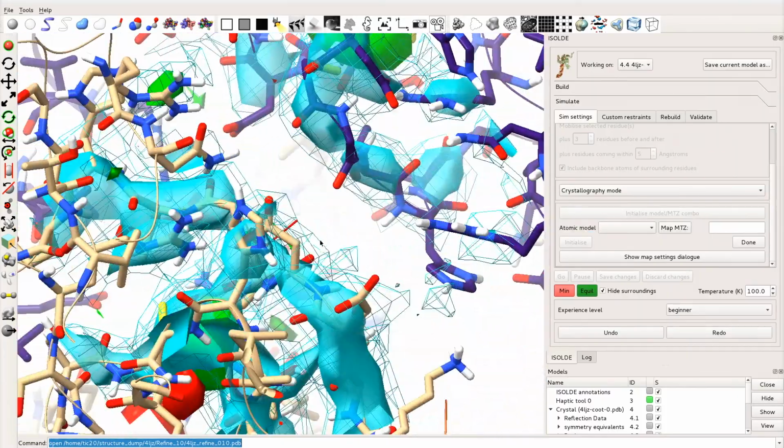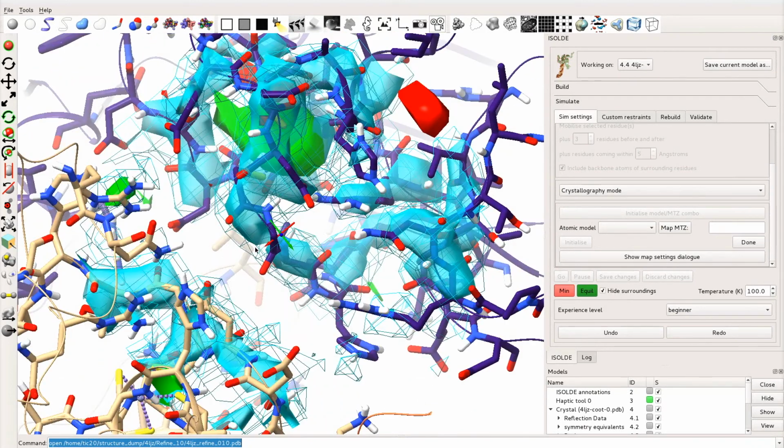In a large structure like this, you'll notice that scrolling is a bit jerky with the occasional long pause. The slow frame rate comes from the overhead in determining which atoms fall within the current focal region, while the pauses occur when a new symmetry molecule comes into range and is automatically cached.